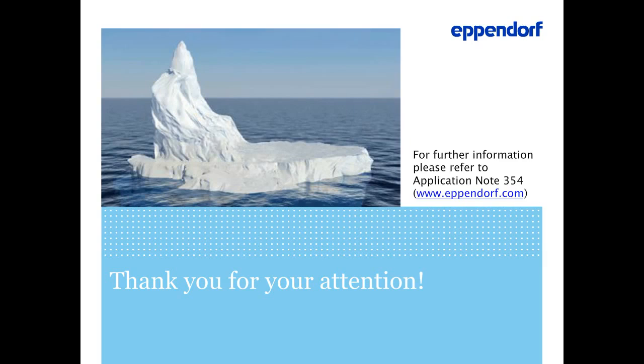So what you can do is, opportunity one would be to cool everything down. But this is something you will probably not like to do, because you need to cool down the lab and the whole system, so the tips, the pipette, the lab, and the liquid, and you don't want to do that. So the other recommendation we can give would be to use a positive displacement principle. So step away from the air cushion principle to the positive displacement principle. There are devices which can be used, and with these devices the piston is within the tip, and the liquid will come into contact with the piston, and then you do not have the air cushion. Generally speaking, the cold temperature liquids is not only a problem for small volumes, but for all volumes actually. So that's a general recommendation.